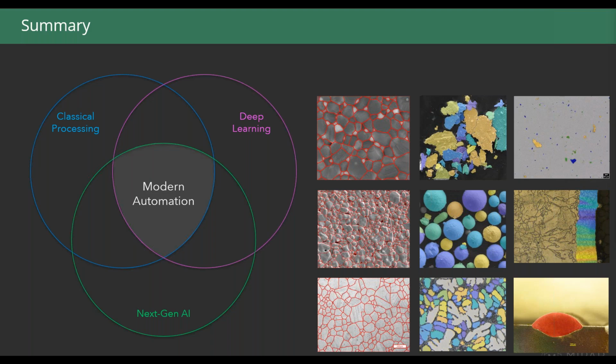Yeah, really good questions there. Let me just take a moment here and digest the scope of the question. So for weld analysis, you're asking, can we explain more about these steps where we get the very bright dark contrast. Do you use pixel contrast, or how do you characterize the edges of the weld? Right. So again, we're really relying on the object boundary, basically the supercharged, if you will, edge detection capabilities of the Spotlight model.